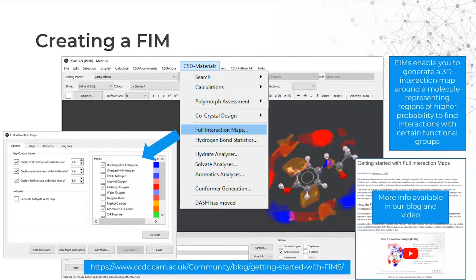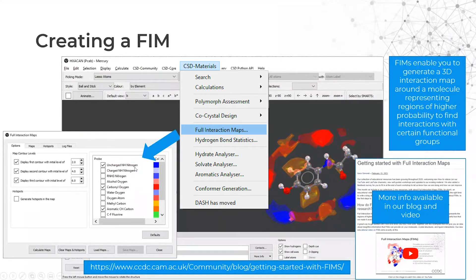Creating full interaction maps in Mercury is really a click of a button. You go to the CSD Materials menu, select Full Interaction Maps, and a menu appears with all the probes available and their colors. Three are selected by default: the uncharged NH nitrogen, the carbonyl oxygen, and the aromatic CH carbon — but you can select what applies best to your structure. You click Calculate Maps and you have the full interaction map for your structure.